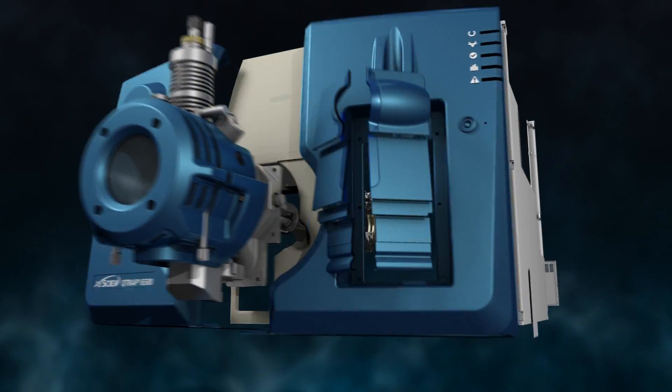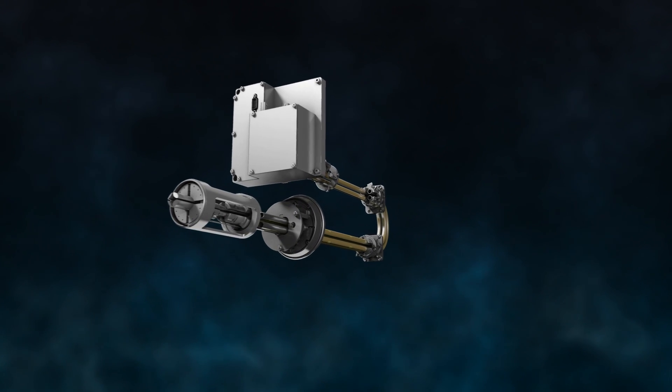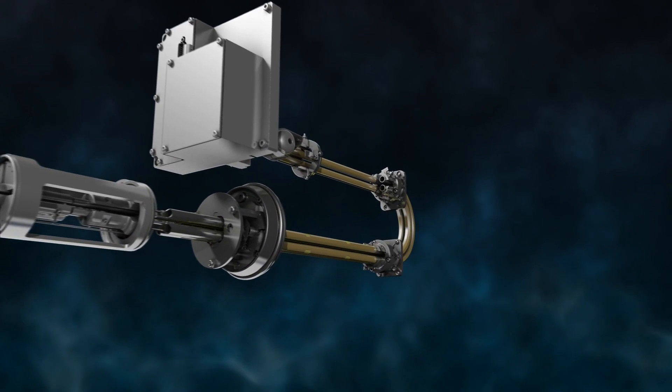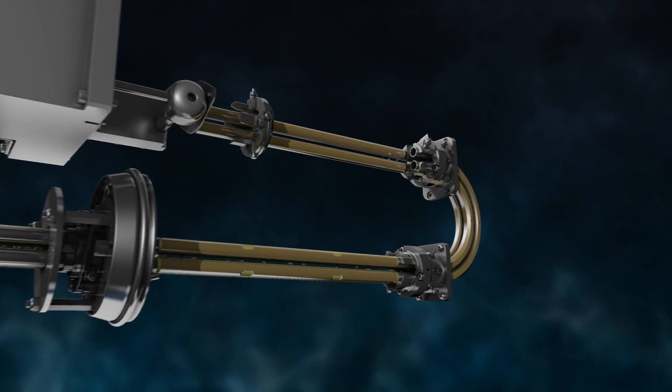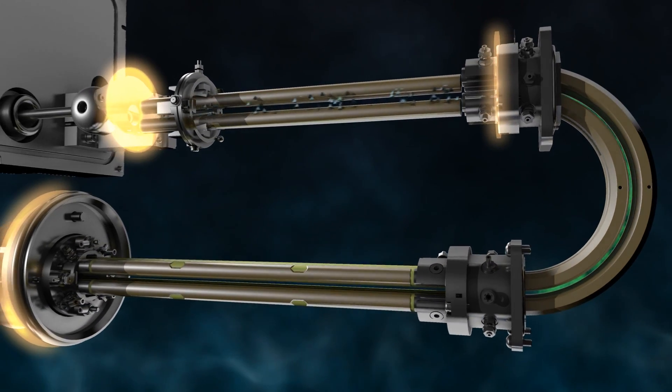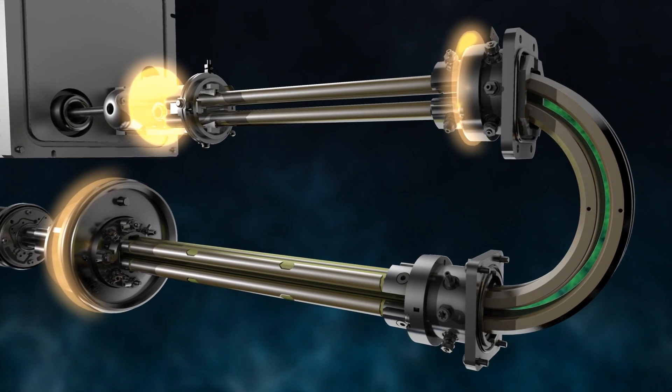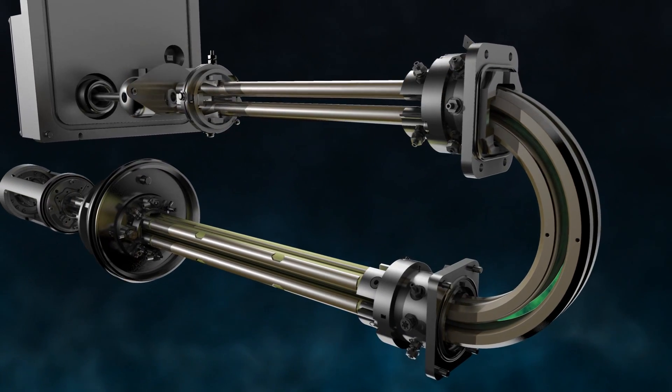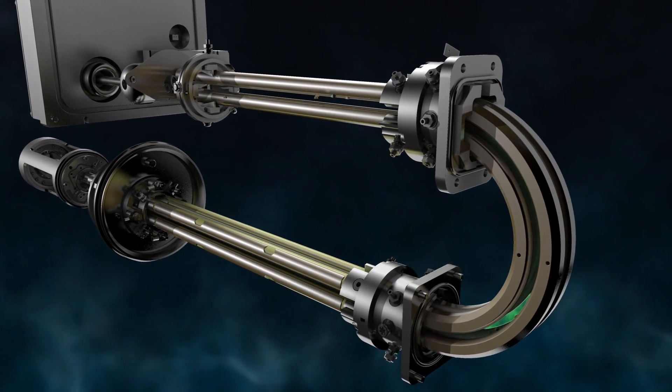At the core of the 6500 series sits the proven curved LINAC collision cell and EQ electronics, delivering scan rates of up to 20,000 Daltons per second and industry-leading dwell times of 1 millisecond, making it ideal for UHPLC workflows.